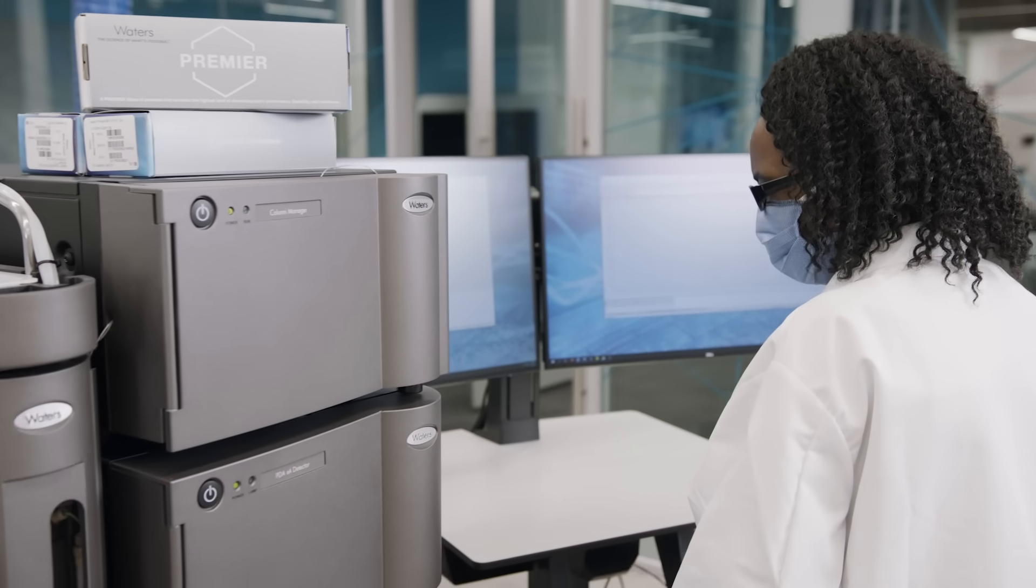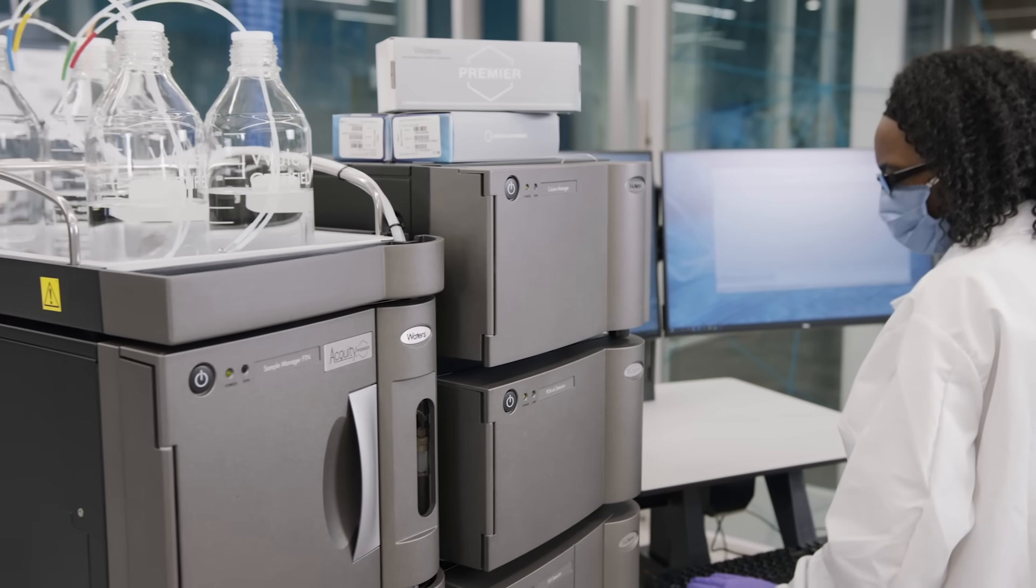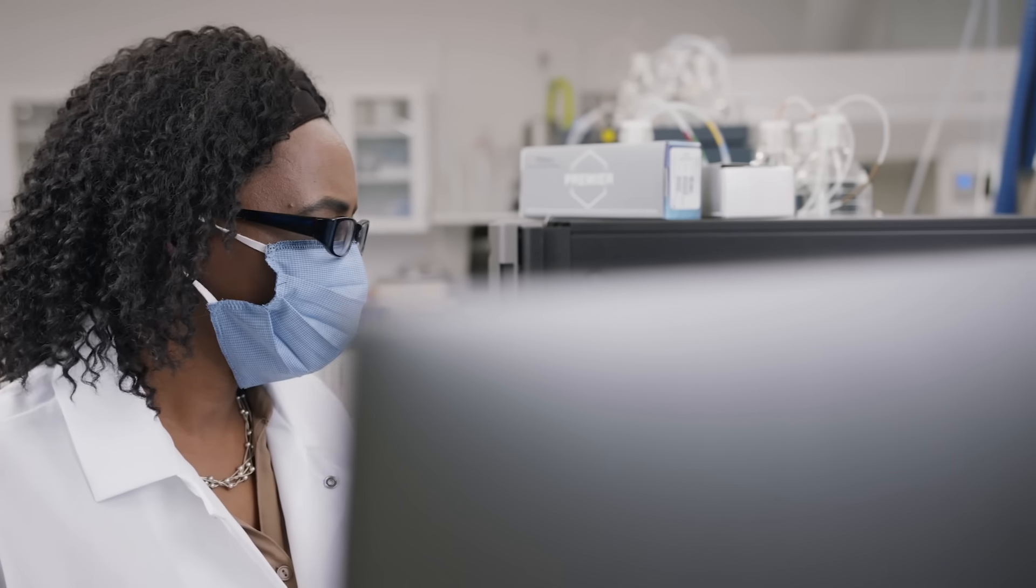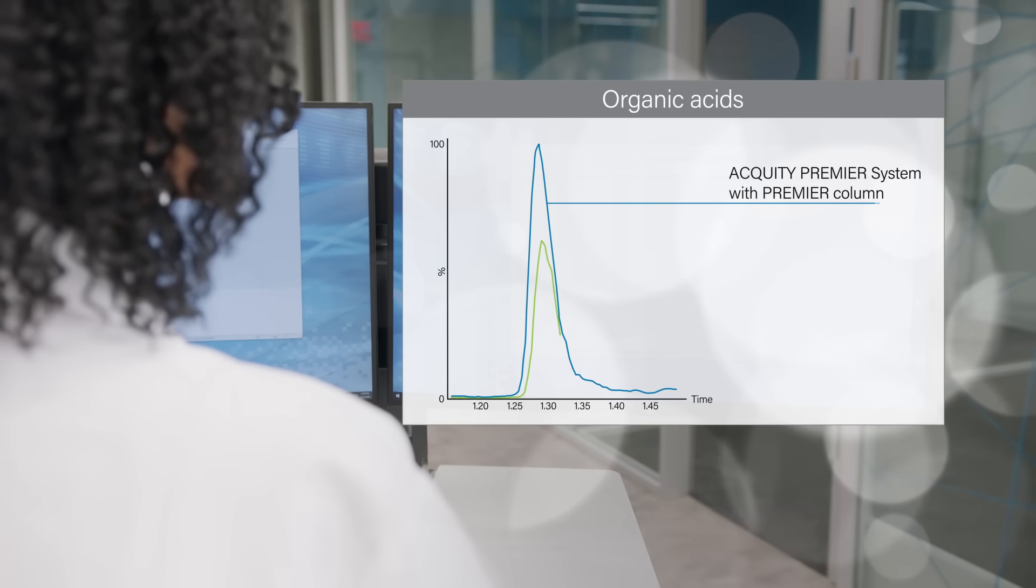See what you couldn't see before with inert system surfaces coupled with advanced mass spectrometry, giving you the lowest limits of detection, enabling you to understand even more about the most challenging applications.